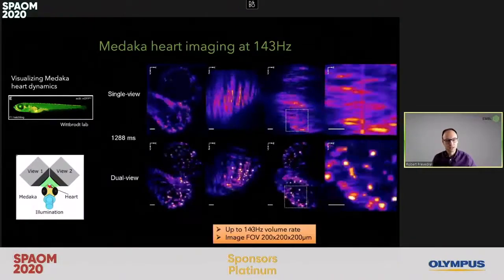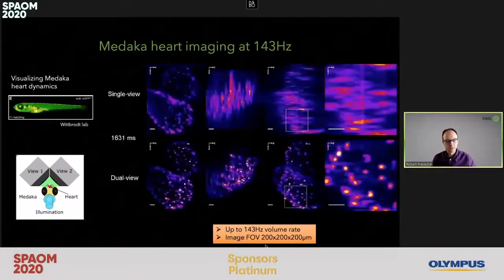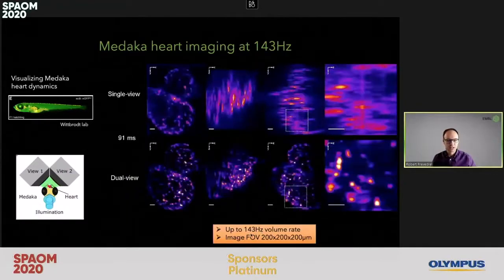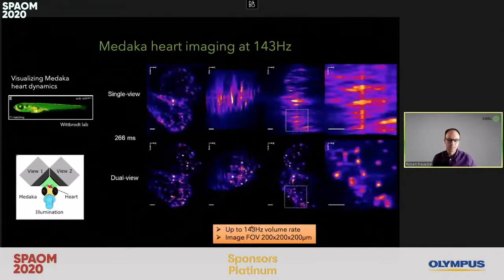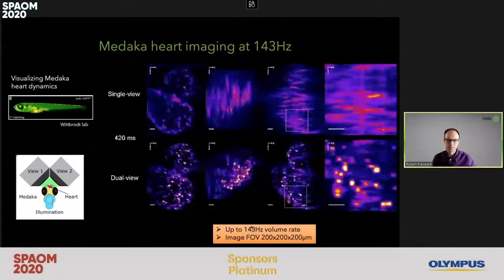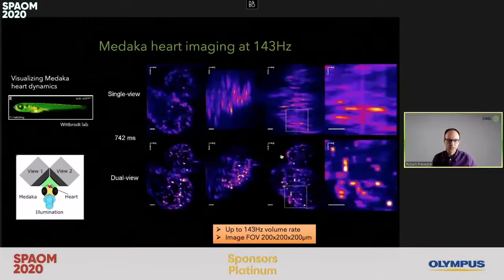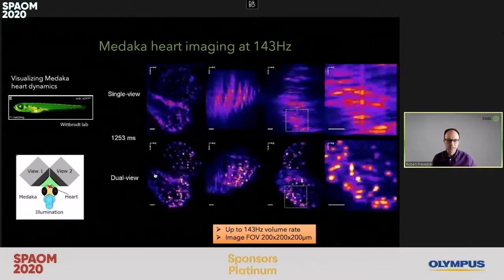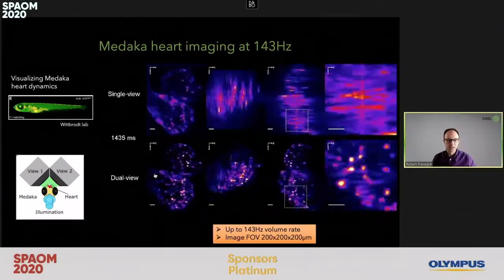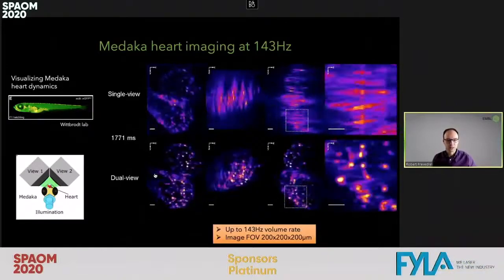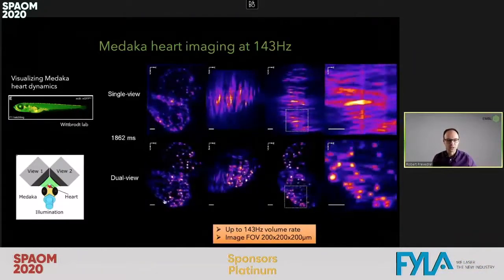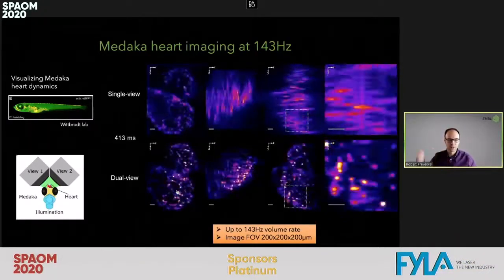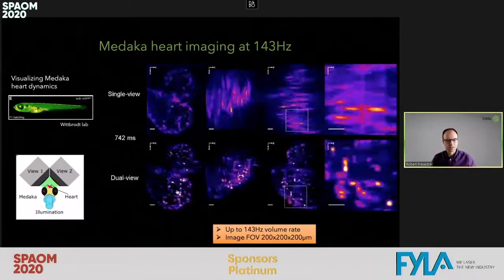We were able to image at a frame rate of more than a hundred hertz of a fairly large imaging volume. This was really the first time we could image the beating heart of the fish in real time, and not reconstruct these movies from different periodic heartbeats.